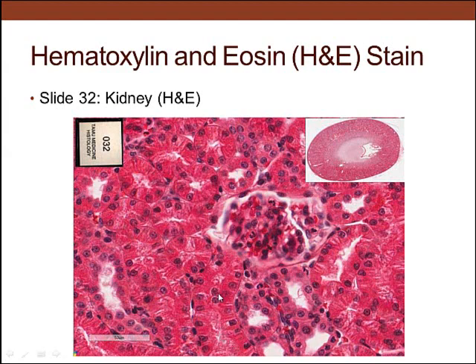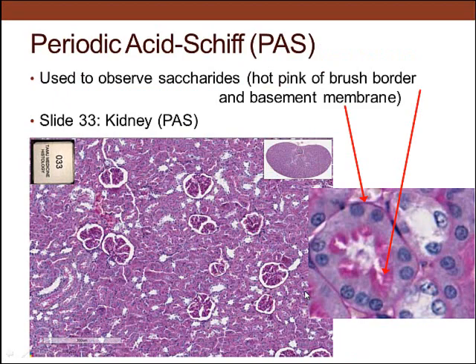Also, if you look in the proximal tubules, you see this flocculent material inside there. This is the brush border. There's a brush border, uniform microvilli, a high density in the proximal tubule, but not in the distal tubule.